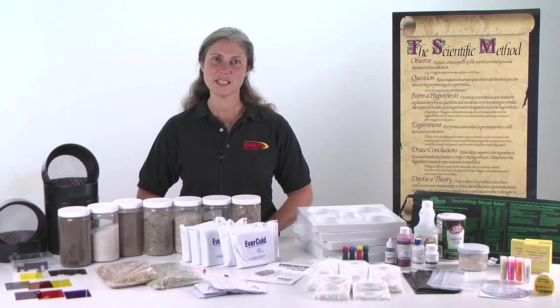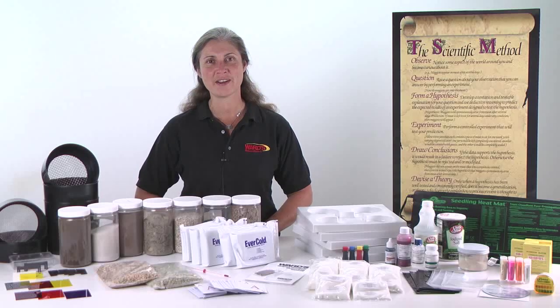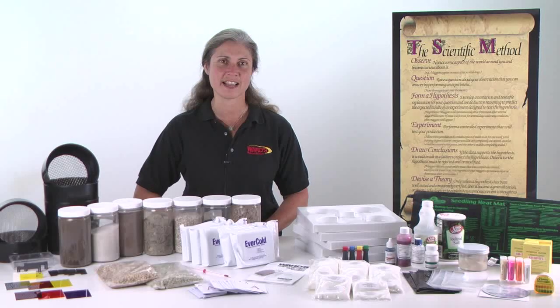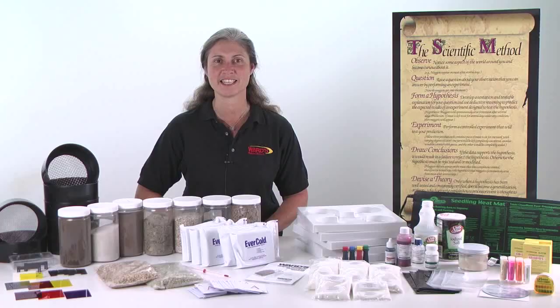In addition to these materials, students can implement a wide variety of other materials and equipment you may have available in your classroom, or they may bring from outside the classroom to help them investigate lab topics and processes.